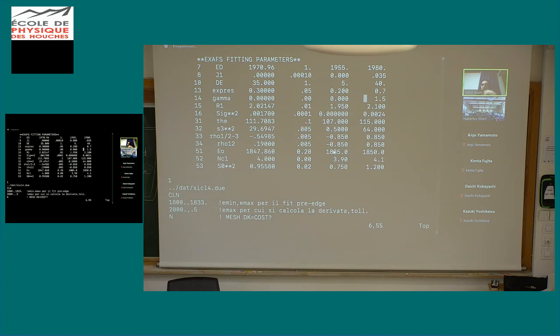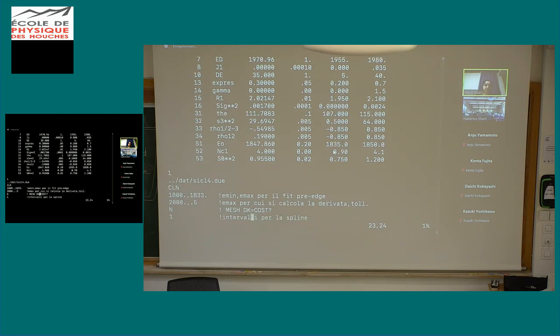How much can we move? Now I will skip the rest for now, and I will talk more about them when we encounter them in the input. Then after that, we should leave one blank line here. This is also important. And then we start the various inputs of the program.